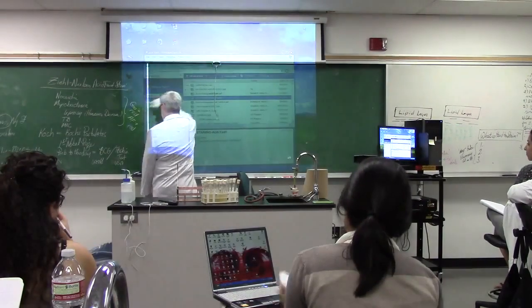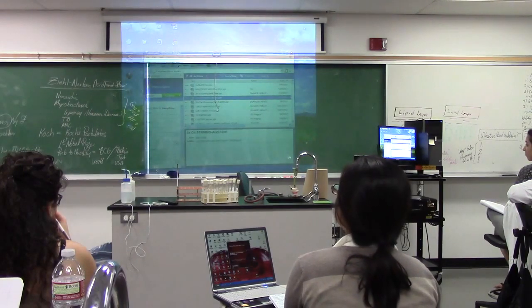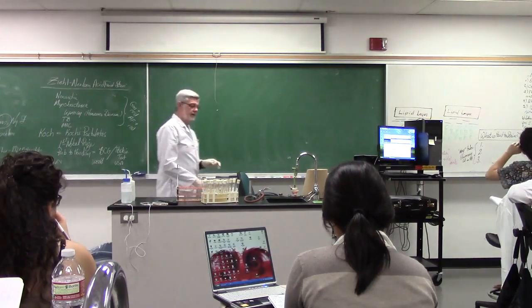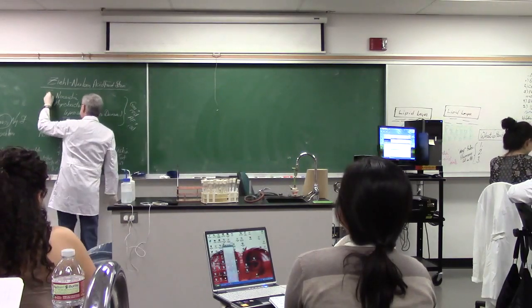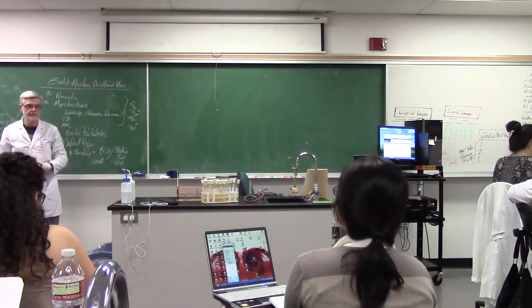And that is, we're going to do everything gram stain, everything acid-fast stain today. And we're going to be talking about the Ziehl-Neelsen acid-fast stain. It is for 2 genera. So who can tell me the 4 things that differential stains tell you? Number 1.